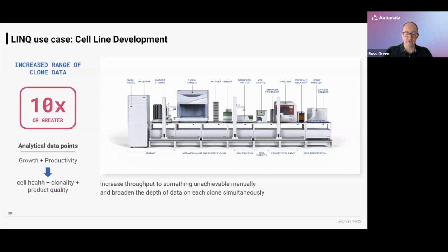And something we saw here is obviously the main focus of the system, actually the main goal of this kind of platform, is to really up the throughput. But the thing I wanted to highlight here is when we got into that "what would you do if you could wave a magic wand" discussion, we started thinking about how we would add on additional analysis devices to get beyond making decisions just around growth and productivity and start thinking about, well, could I look deeper at the cell health or the morphology of those cells and the clonality and different data about the product quality as well, and make a much deeper data set around the clones that we're selecting.